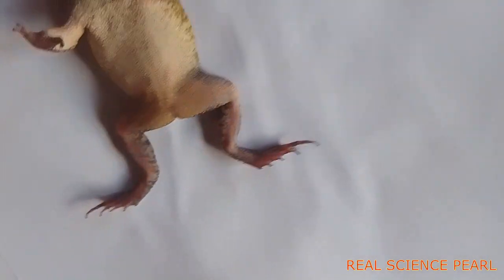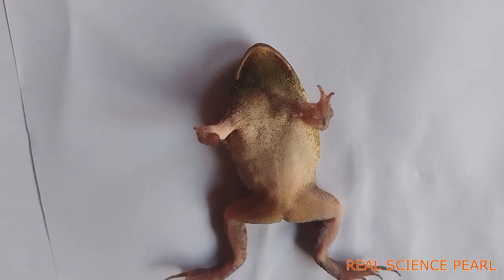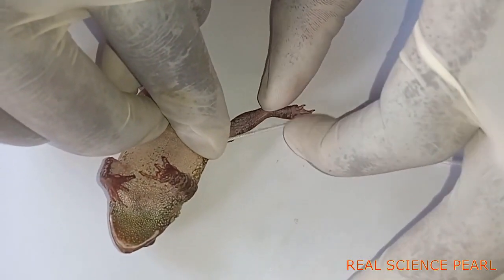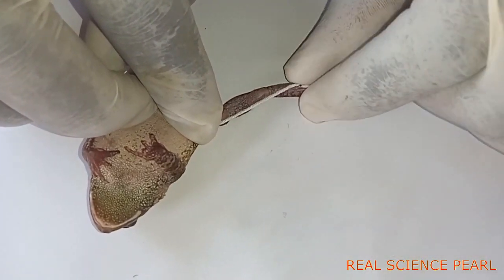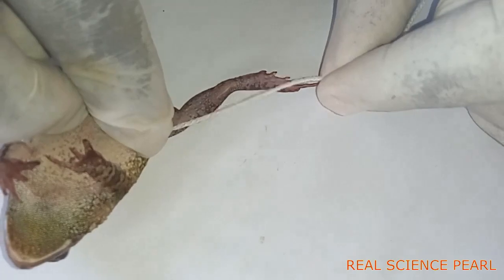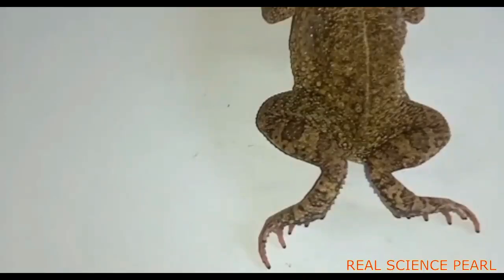The hind limb is long to generate sufficient propulsive force for leaping. It has five webbed digits for gripping the ground to gain stability during leaping on land, and also in water to enable swimming.